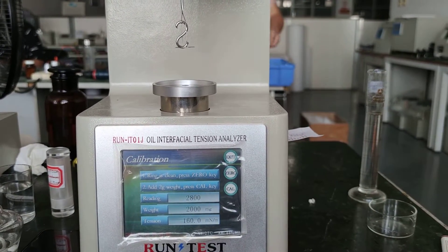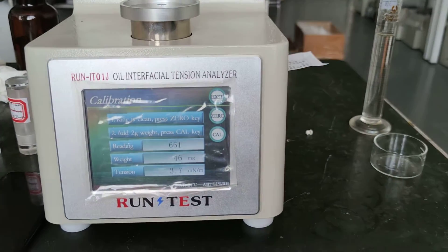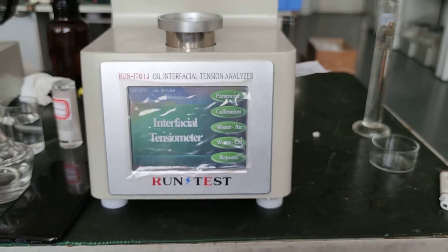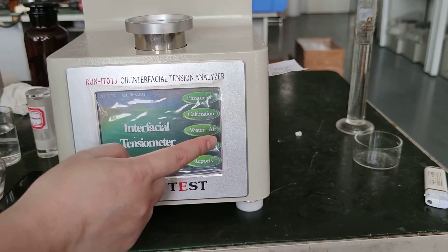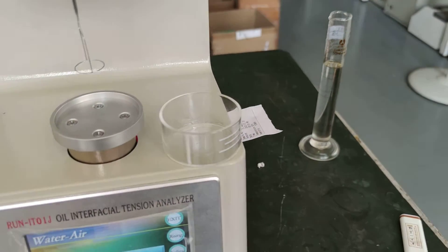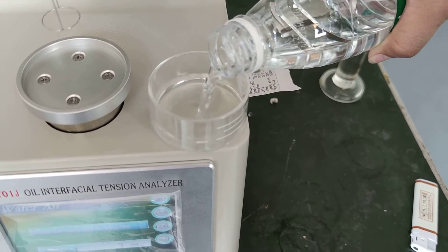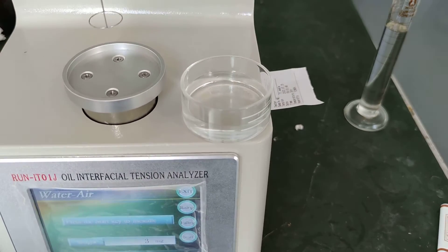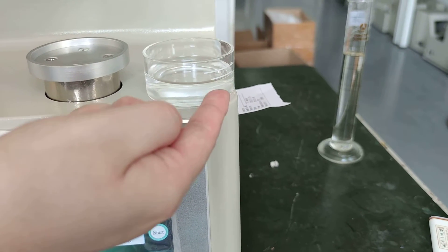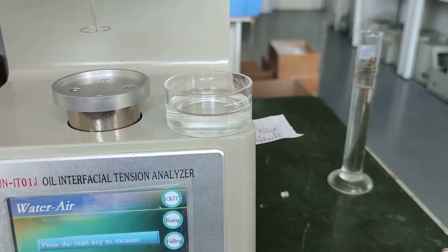Remove the weight and exit. We will do a water surface tension test first. Take out the oil cap and put in pure water. The water level should be higher than the bottom white line but lower than the second white line.